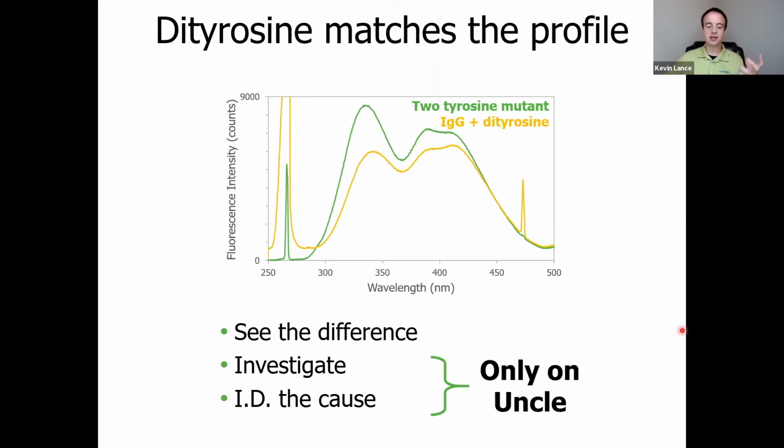When we've added a second tyrosine to our protein, what we've actually done is given it an ability to start forming dityrosine in our protein. That perhaps explains the quenching effect through the lower tyrosine signal, and explains that additional redshift behavior that we're seeing at higher temperatures that was unexpected when we compare it to our 1 tyrosine sample.